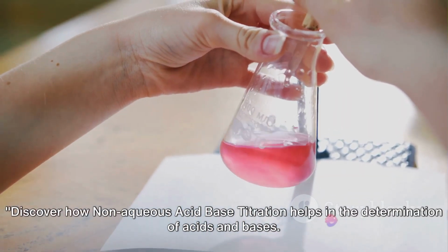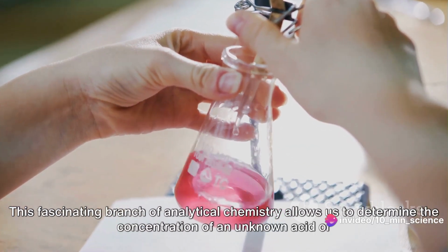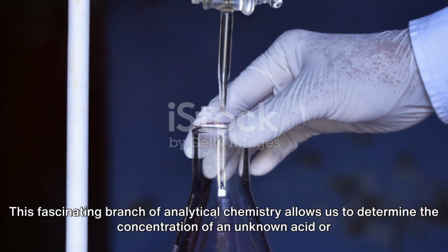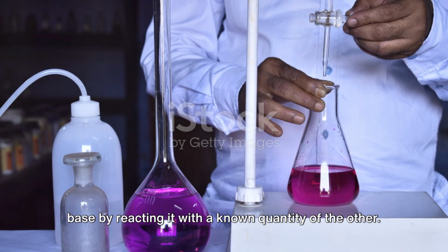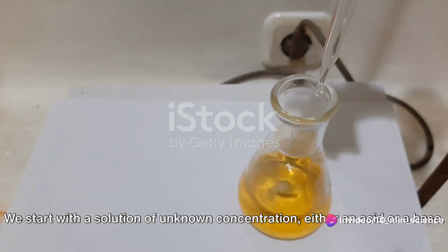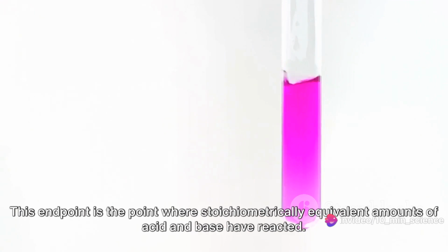Discover how non-aqueous acid-base titration helps in the determination of acids and bases. This fascinating branch of analytical chemistry allows us to determine the concentration of an unknown acid or base by reacting it with a known quantity of the other. Let's delve into the process. We start with a solution of unknown concentration, either an acid or a base. To this, we gradually add a solution of known concentration, the titrant, until we reach the endpoint of the titration. This endpoint is the point where stoichiometrically equivalent amounts of acid and base have reacted.